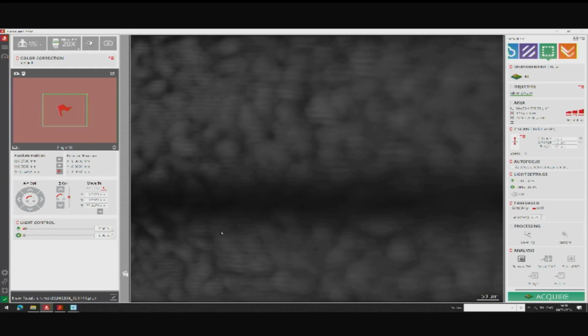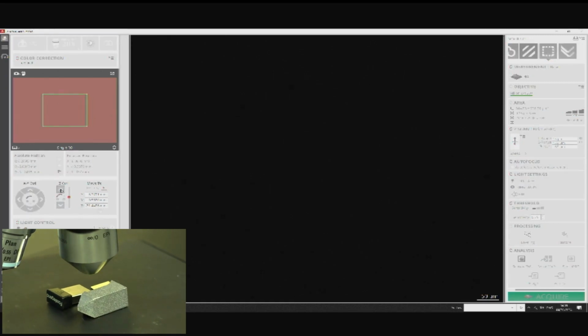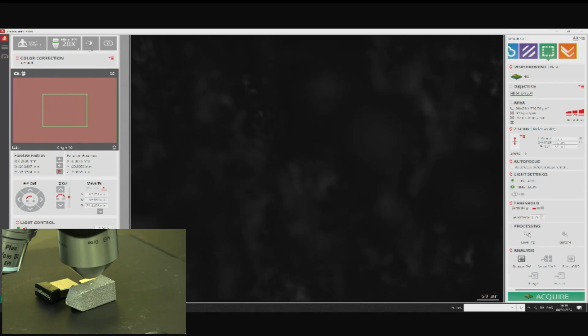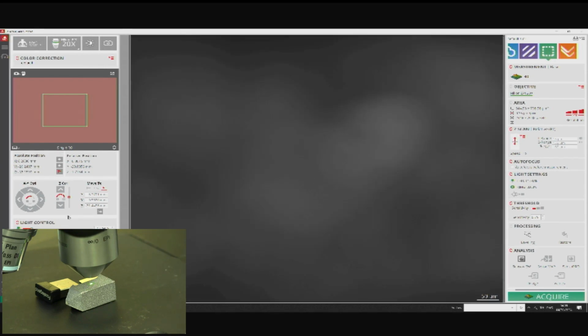Now we're going to go back to our focus variation. We're going to measure a sample that has a textured surface. I'm going to place that onto the bed, and I'm just going to go and find the sample on the system. Just need to find the material. We can see here we've got a visual of the texture of the surface. I'm going to set my lighting slightly less, and we're just going to take one sample, but this texture is going to be much more coarse.